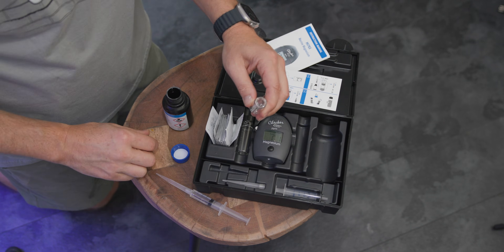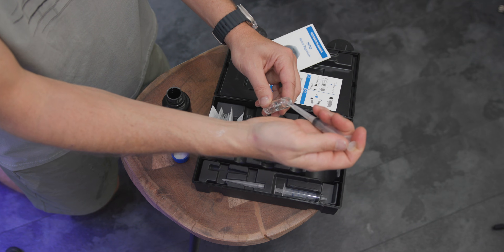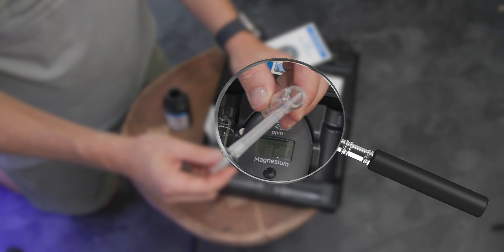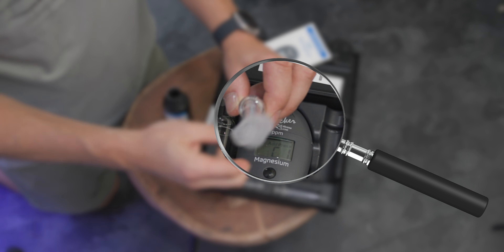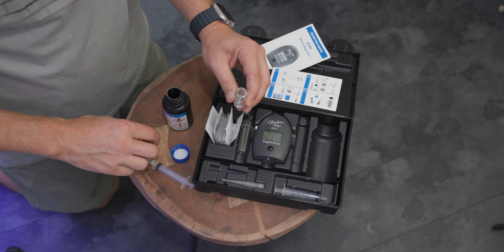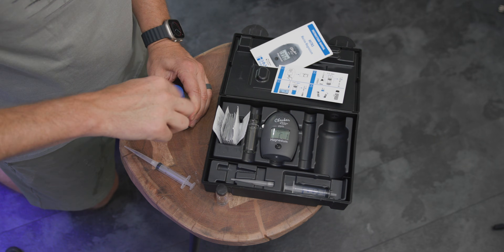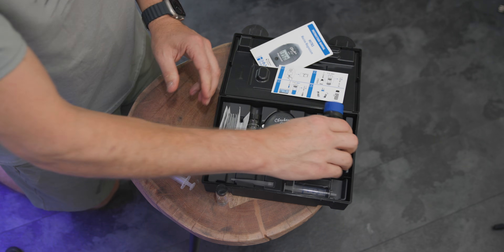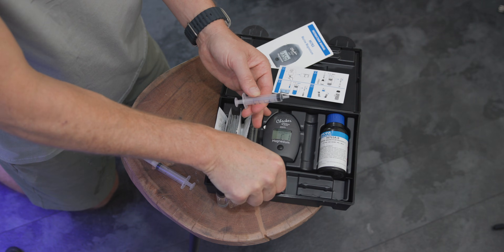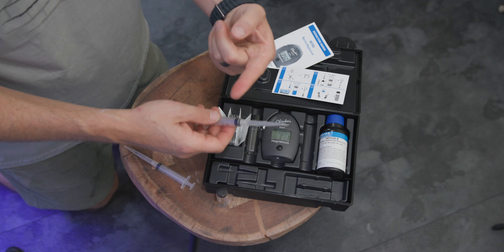Grab your cuvette, stick the syringe down in there, and blow it out. Hanna now specifies in the directions that you want to make sure all the reagent is out of the tip. If there's a little bit of liquid left, pull some air back in and push it out. Then put the cap back on your reagent before you knock it over. Now use the blue hash-marked syringe, put the tip on, and go get five mils of tank water.